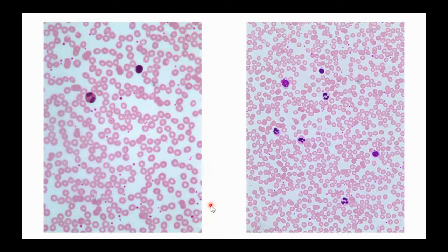So we're looking at my red blood cells called erythrocytes, and the white blood cells that come in multiple different colors. I got a red one over here, a really dark one over here. This might be a blue one. So we are looking at the white blood cells that are bigger. From the group work project, we should have figured out that my white blood cells, my leukocytes, are bigger than my erythrocytes, the red ones here.